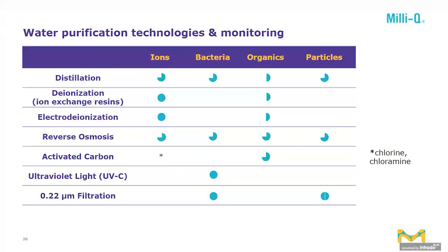The only contaminant it does not remove quite as well is probably organics, especially organic molecules that boil close to 100 degrees, similar to water, may be carried along. So they may be present in your distilled water. Also, distillation is a pretty slow process, so while it is being performed, water may recontaminate itself a little bit.